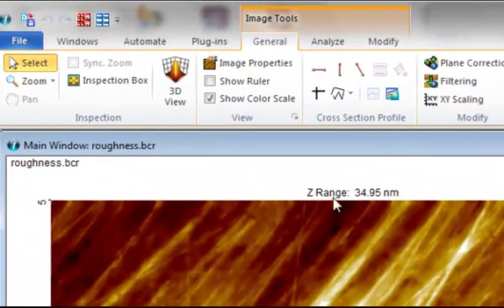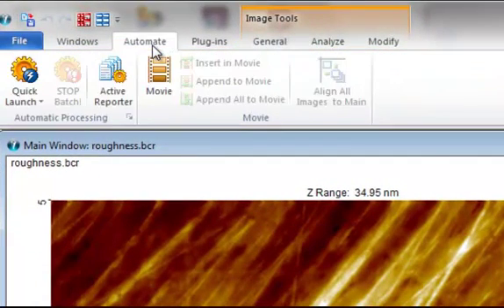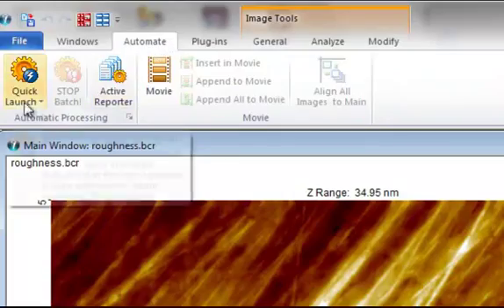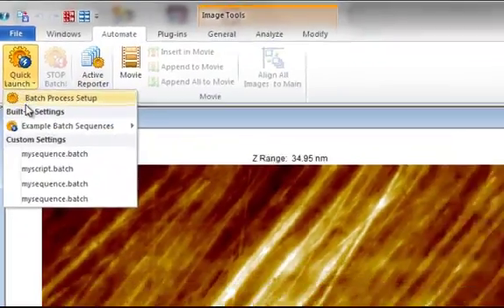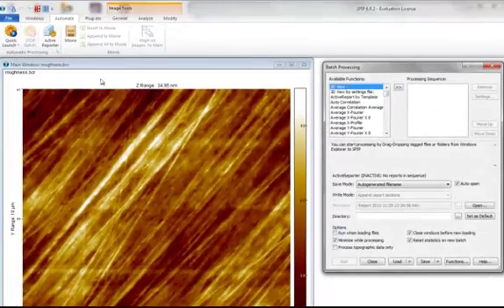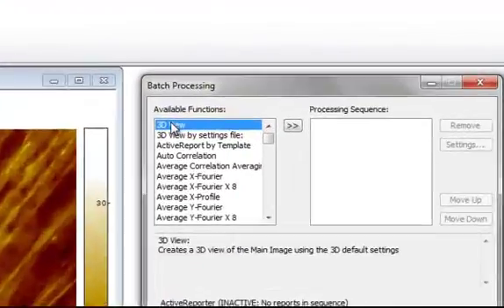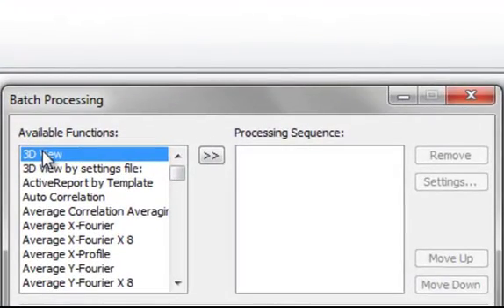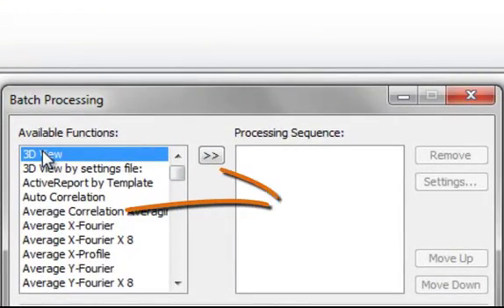Let's go to the automate tab where you'll find the automation tools. Now, open the batch process setup dialog. We can define the processing sequence simply by adding the relevant operations from the list of available functions.